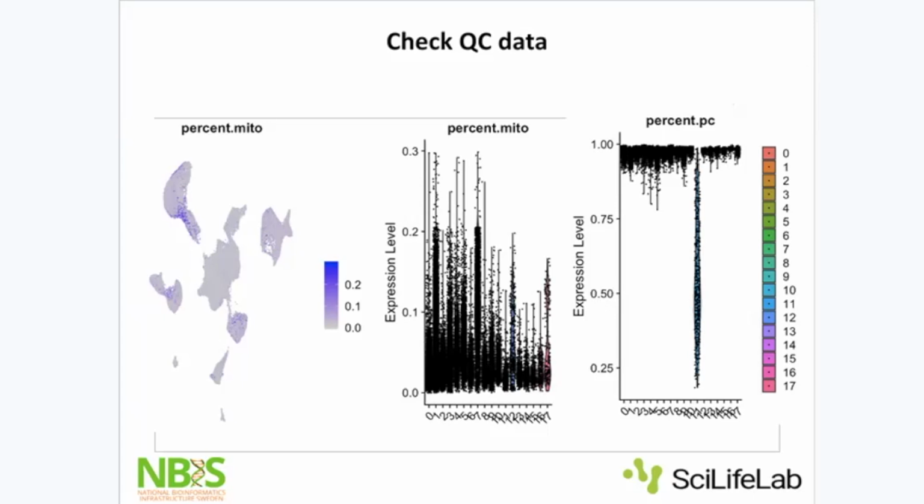Thank you. Yeah, I saw in one paper about cluster validity index. I mean, whether the cluster is good or bad, they are checking with different kinds of validity index. So those kinds of methods can be applicable over here too. But I'm not aware of this. Was this with single cell data? No, I didn't check it with single cell data.